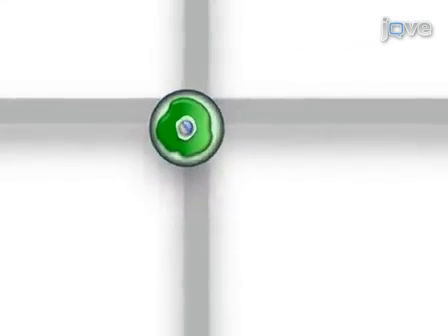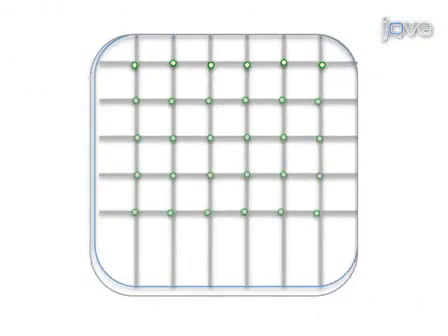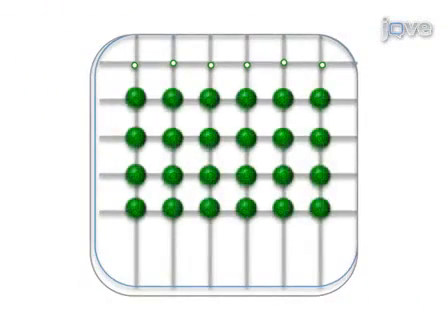These are transferred onto TAP-Difco plates for germination under low light. Tetrads are then separated and grown under appropriate conditions until visible clones appear. These can be picked for subsequent analysis.